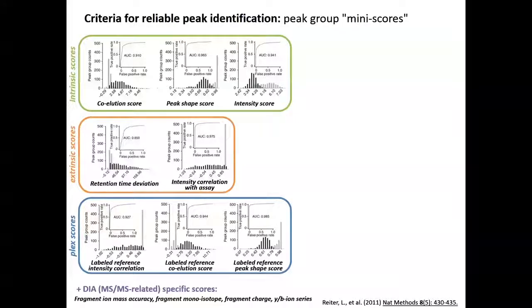Most of the targets gather around a dot product of 1, while the decoys have a relatively bad dot product. Same for retention time: most of the targets are close to the library, close to a delta retention time of 0. While the decoys flatten out, because they have a retention time completely random in the extraction window, etc., etc.